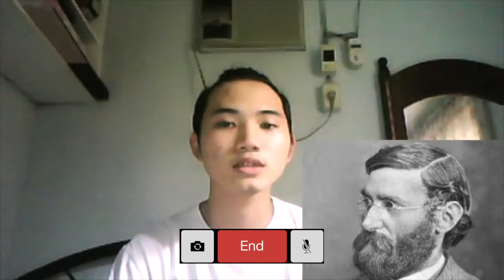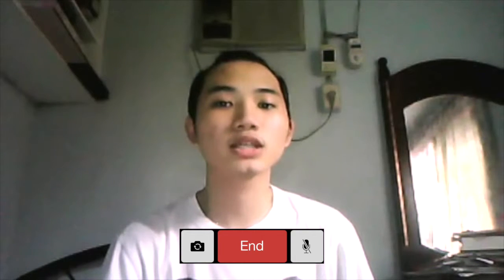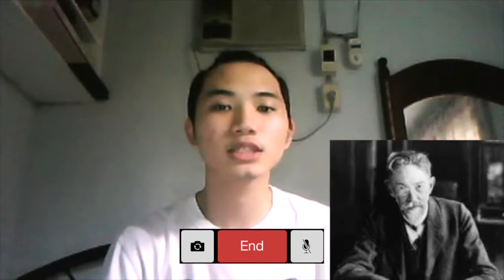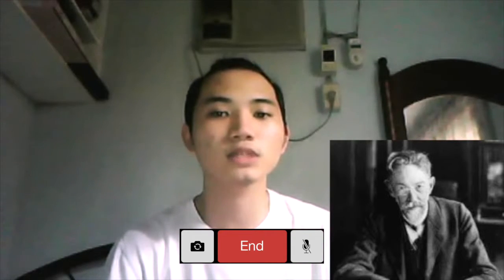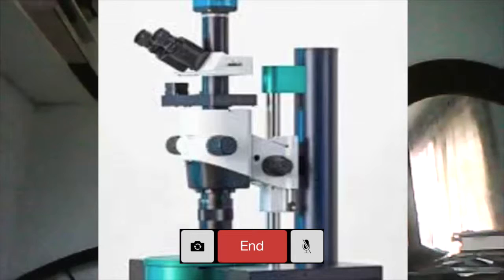In 1878, a German optical scientist named Ernst Abbe invented a theory linking resolution to the wavelength of light. Then, in 1903, an Austrian-Hungarian chemist named Richard Zsigmondy invented the ultramicroscope, which allows for observation of specimens below the wavelength of light. An ultramicroscope is a microscope with a system of illumination that allows viewing of tiny particles.